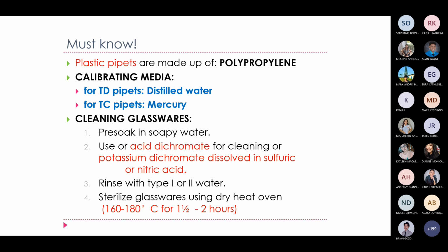Ito, for procedures like HPLC, electrophoresis, sa toxicology. And yung ating mga standards or yung mga buffers natin nakasama sa reagent, 'di ba? Sa mga reagent kits and yung mga controls. So kailangan type 1 water. This is the one ideal na dapat gamitin for these types of tests and solutions.